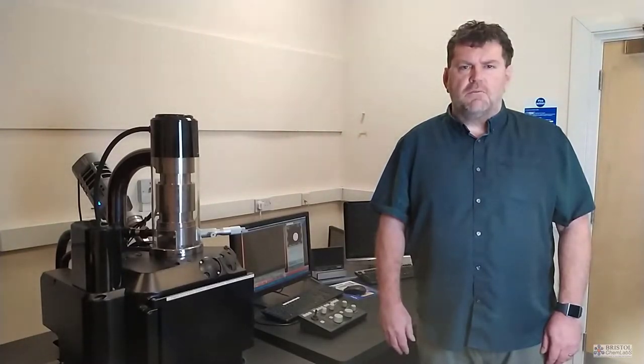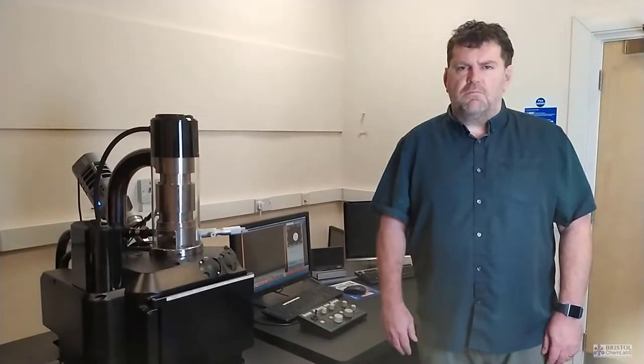Within the imaging facility, we've got a range of advanced microscopes, including electron microscopes and atomic force microscopes. During this brief introduction, I'm going to demonstrate two of our key electron microscopes: the scanning electron microscope and the transmission electron microscope.